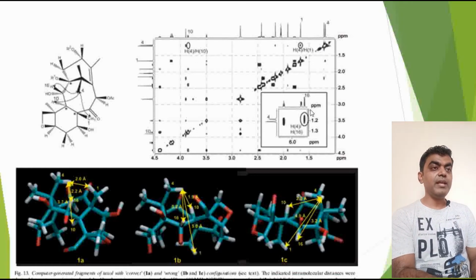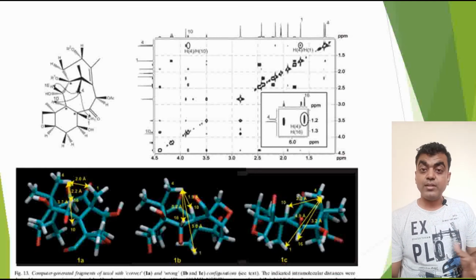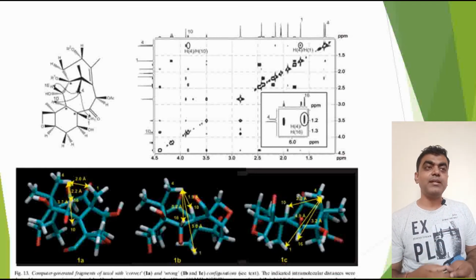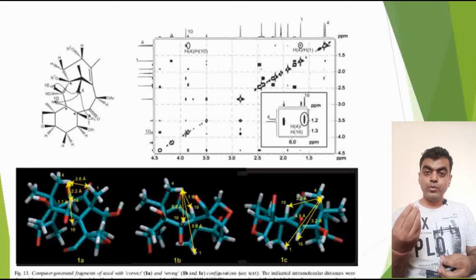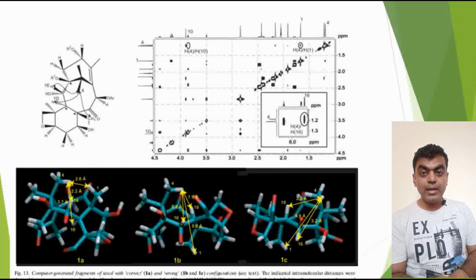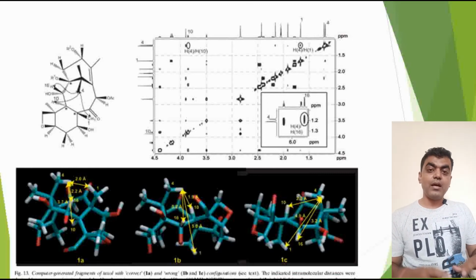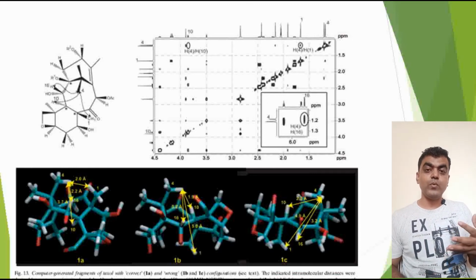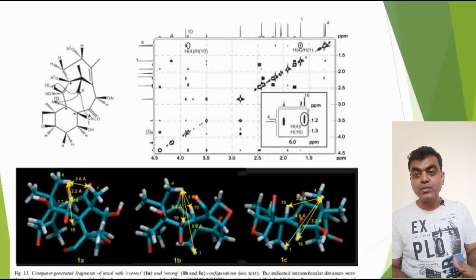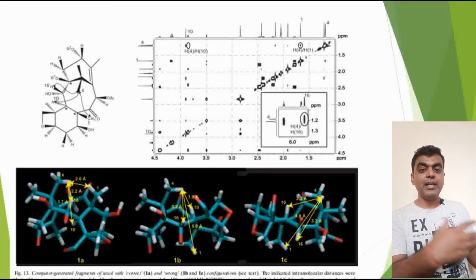You need to zoom in, and this assignment is very important. This assignment is not that easy. It takes time, it takes understanding. You start your early NMR life with a single compound, where you know the structure very well, where you know the stereochemistry very well, where you understand what the cis-trans positioning can be, where you understand what DL rotations can be, you understand the functional groups, you understand everything. Then you try to find it out through the NMR spectra.